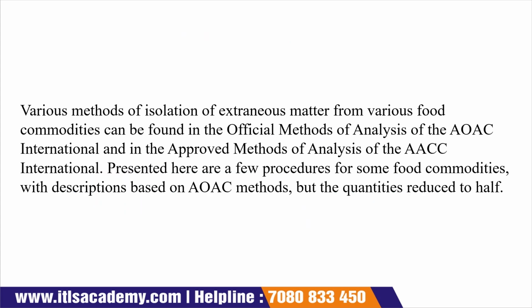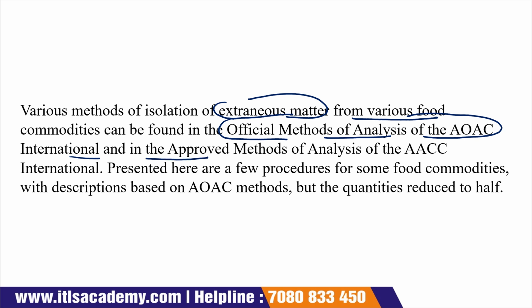Now the next point is that various methods are available for the isolation of this extraneous matter from the food product, okay. They can be found in the Official Methods of Analysis of AOAC International and the Approved Methods of Analysis of AACC International. Okay, where is it available? Official Methods of Analysis of AOAC International and Approved Methods of Analysis of AACC International.